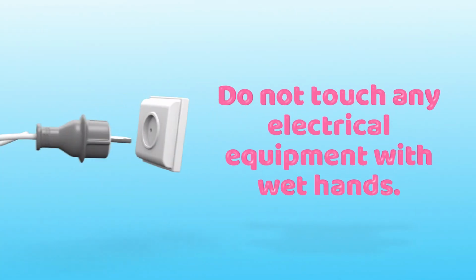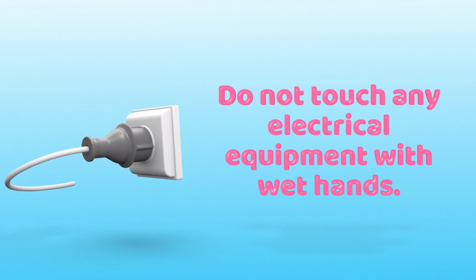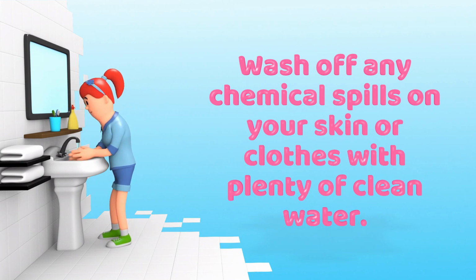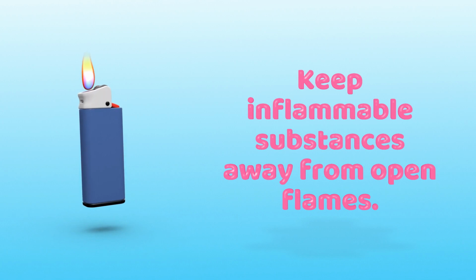Also, when you are in the laboratory, do not touch any electrical equipment with your wet hands, because this can lead to an electrical shock. Again, make sure you wash off any chemical spills on your skin or clothes with plenty of clean water. And make sure that any substance which can catch fire easily is kept away from open flames.